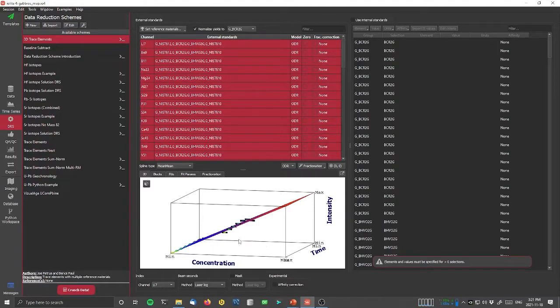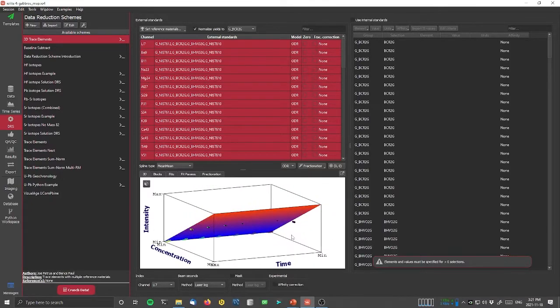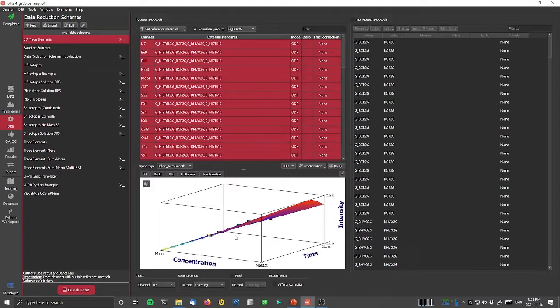We've determined our blocks and we fit a calibration curve to all of our blocks, and we've used that to calculate a calibration surface. I'm just going to change that back to auto smooth. But we haven't actually calculated any final results. We haven't calculated our ppm channels, and we do that by clicking the Crunch Data button. Now, depending on how many channels you've measured and how many blocks and how much data you've collected, it will change how long this takes. In this case, we didn't actually see the import stage, but it was about 30 megabytes of data because it was measured over a reasonable amount of time.